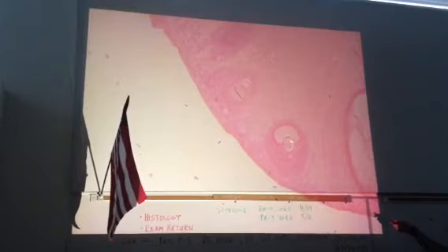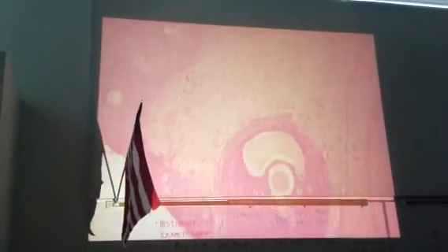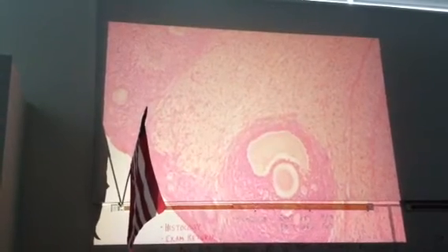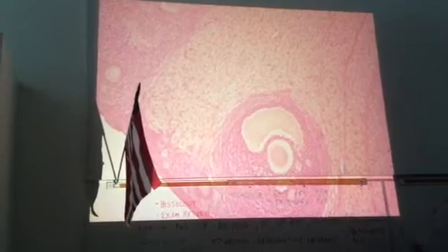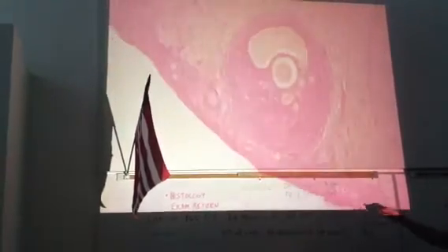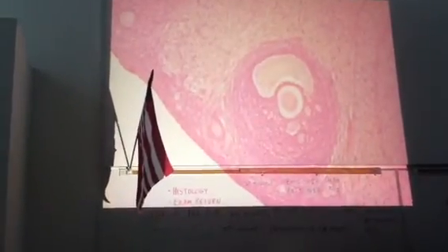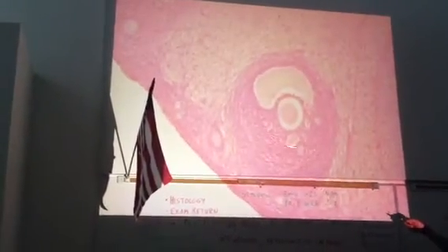So here, this now is a secondary follicle, and it's gotten bigger. All the cells around it are called nurse cells. This C-shaped space is referred to as an antrum, and it has fluid in it. At the time of ovulation, the hormone released is called luteinizing hormone. We'll talk about it today. It's going to cause some smooth muscle out here to contract. It puts pressure on this non-compressible fluid in this space, and it forces that cell out through the wall, and that's when ovulation occurs. Now, all of the cells that are present here are called nurse cells. They're just helping with the process.